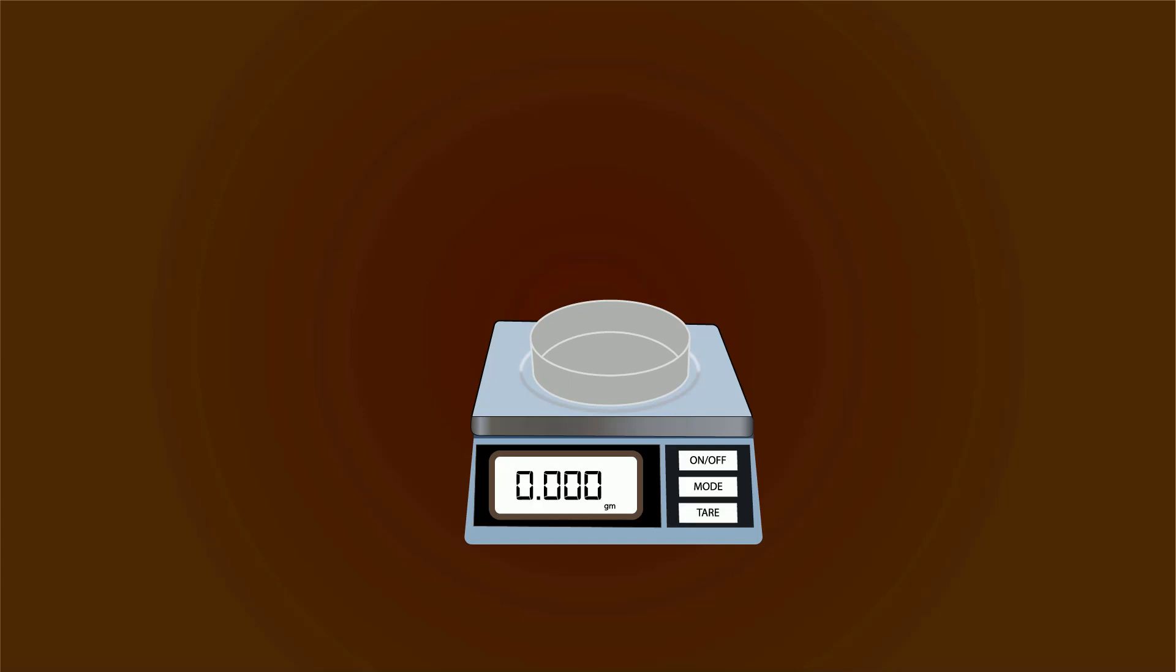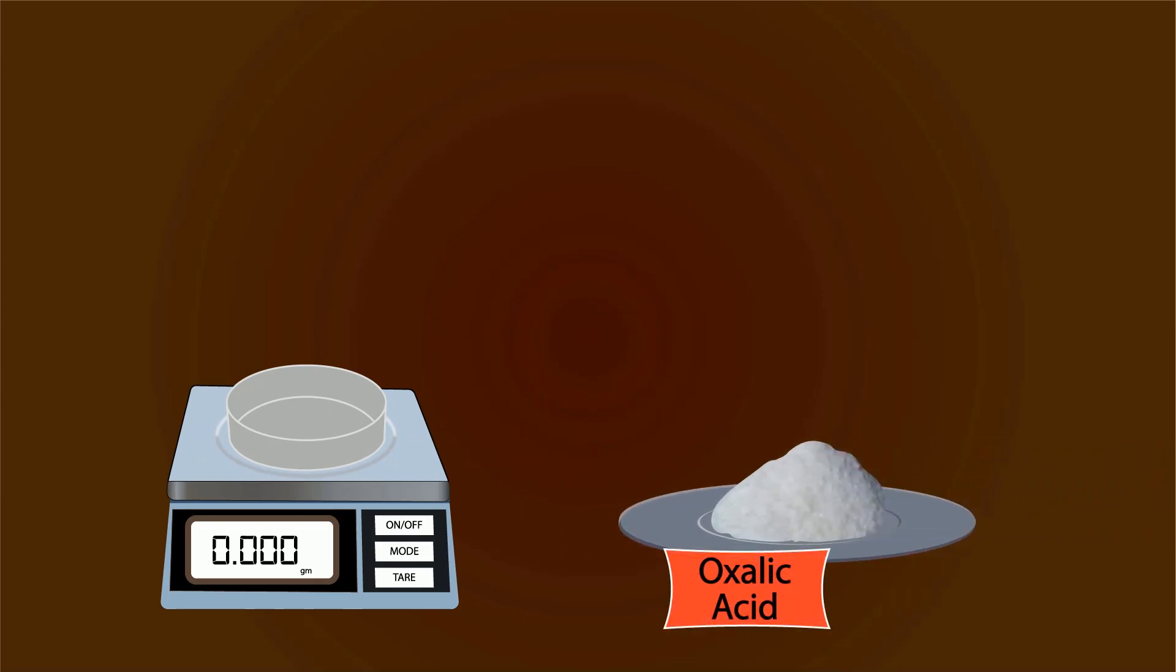Now start adding oxalic acid into the petri dish with the help of a spatula. We have to measure oxalic acid up to 12.6 grams.